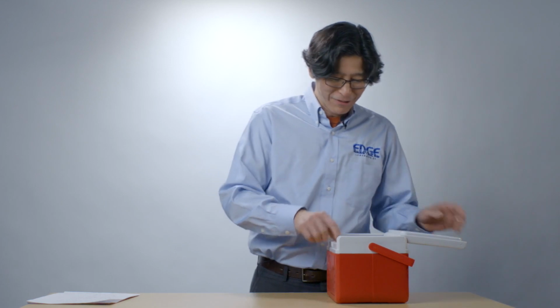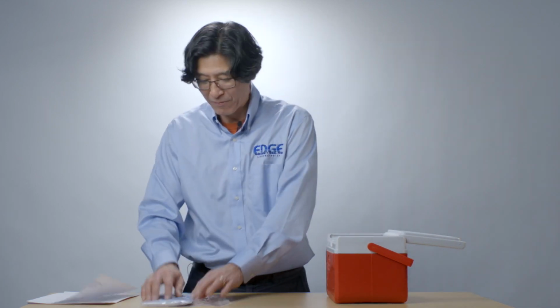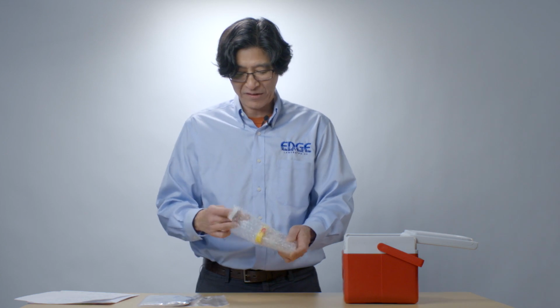Now, first thing we're going to do is take a look in our cooler. This is what's in your typical sampling kit. Some gloves to protect yourself while you're taking your sample, and then our sample vials. There are 3 vials in here, and we're going to open this up and take a look at what we have.